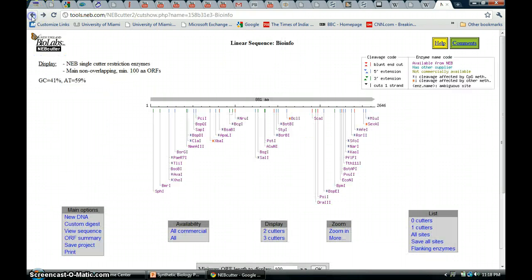So this gives us more or less how we can use a REBASE site to know which inserts can be generated with the restriction enzymes, and we can tag green fluorescent proteins or red fluorescent proteins with our gene of interest and see where they are expressed, whether they are expressed at developmental stages.